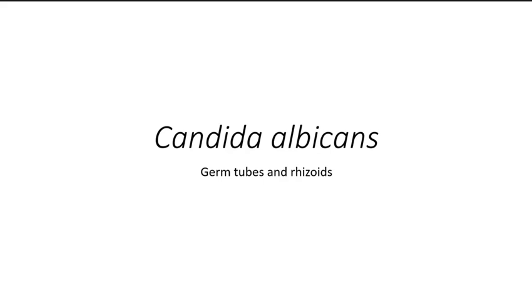Hey you guys. Okay, I know that you guys did go over Candida albicans and rhizoids and germ tubes, but I do want to go over them again with you, also discussing how to set up the lab for that, how to set up a germ tube test.